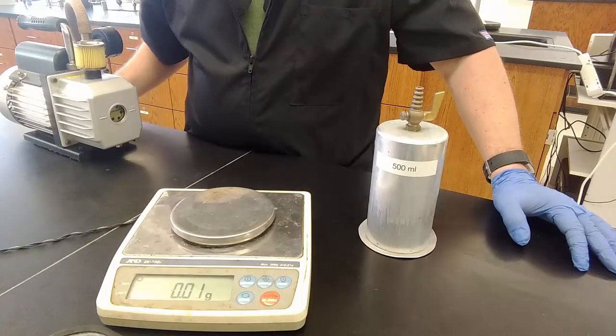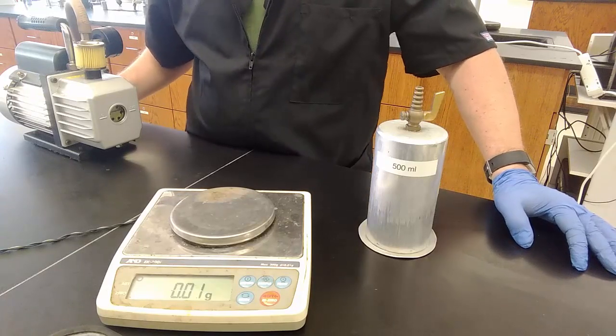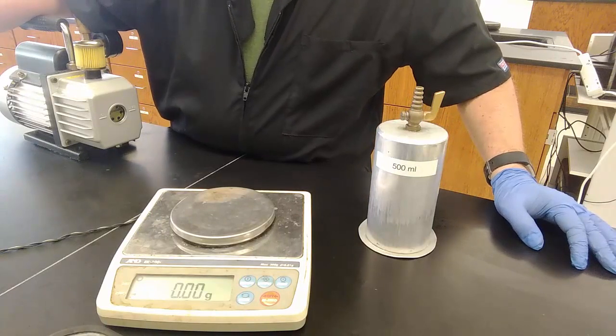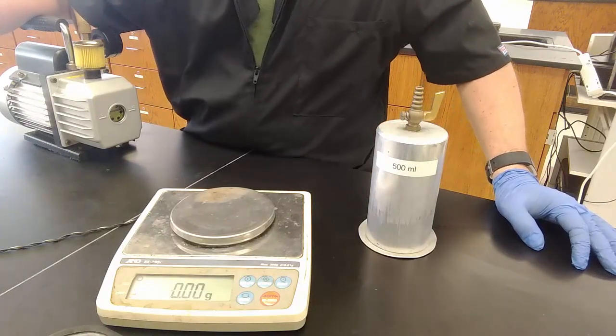Lab 1, density. Section 3, the density of air. Confirming the density of air, because we know what the density of air is, okay? You can look on table 1.1. The density of air is 1.185 grams per liter.